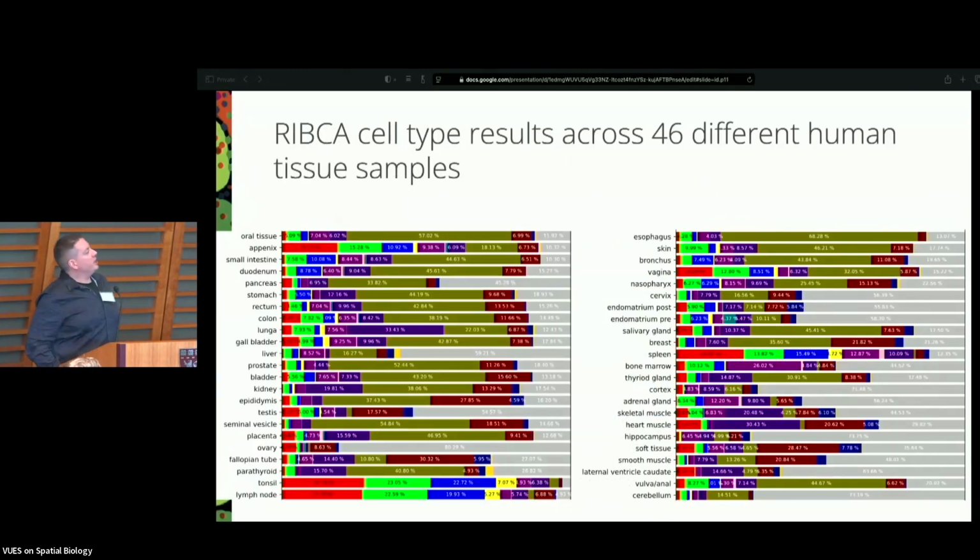All right, and so these are the HPA results, the cell types across different tissues. There is some heterogeneity in performance between tissues, especially liver and ovary, which have a large proportion of cells marked other. A lot of this is due to the panels that can be applied to each of these data sets. If the markers just don't match, we can't impute more than 1, 2, or 3. There isn't much to do besides call that cell other.